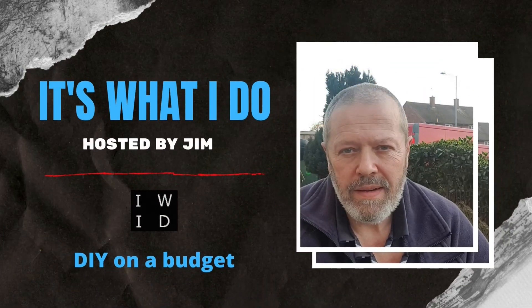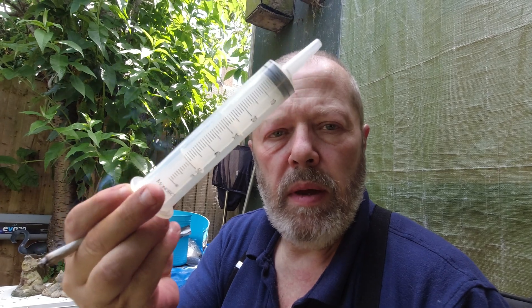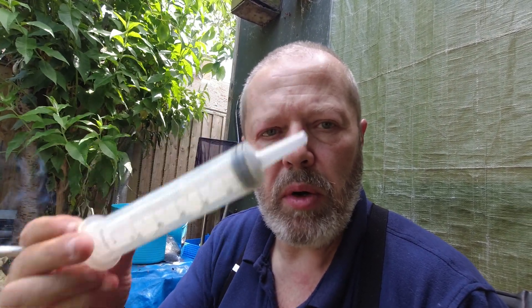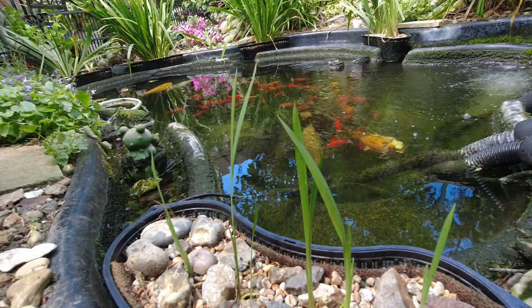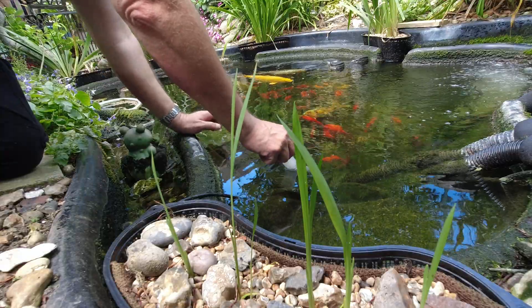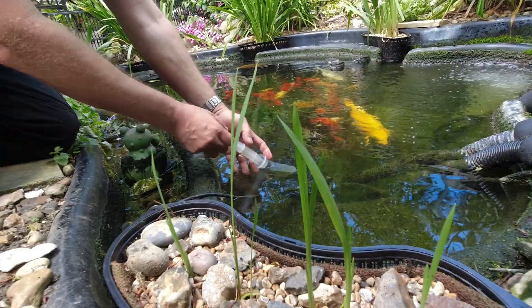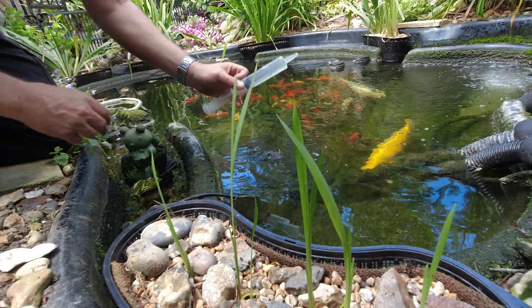Hello and welcome back to 'It's What I Do'. Today in this quick video we're going to do some water tests on the pond, so stick around and we'll see what the results are. I've got a syringe that I draw water out of the pond with for my test tube. We'll take the syringe and plunge it into the water so that we're a good three or four inches below the surface and draw a nice syringe full of water.